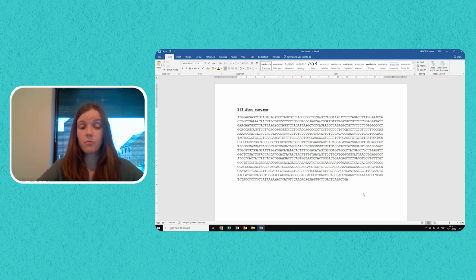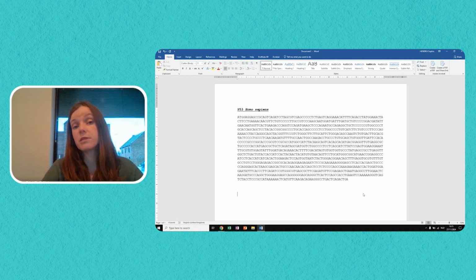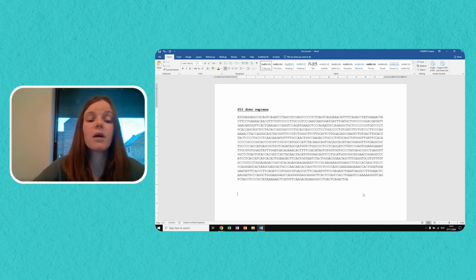Now, what you might remember from the lecture on primer design is that generally we try to design primers in such a way that they bind either on top of an exon-exon boundary or across an exon-exon boundary. So that would mean one primer binds in, for example, the first exon, the second primer binds in the subsequent exon, so exon 2. Of course, if we want to do this, we have to know where the exon-exon boundaries are located.